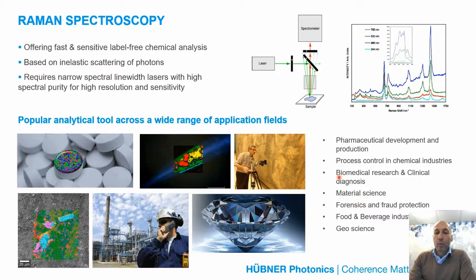It's also more and more commonly used in biomedical research, and it's also paving its way into clinical diagnosis applications thanks to its capability for rapid detection of infectious microorganisms and also with the potential of providing early cancer detection.